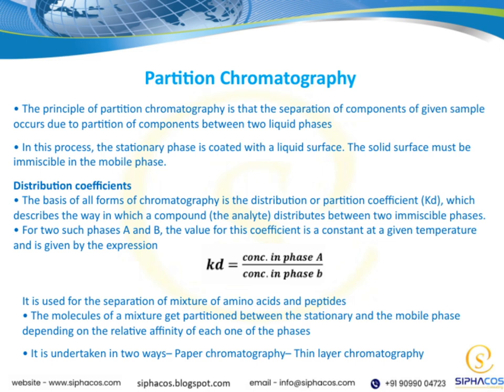A crucial concept here is the distribution coefficient, often called K_D. This coefficient describes how a compound, or analyte, distributes itself between these two immiscible phases. It's a constant value at a given temperature, and it's fundamental because it tells us how a particular molecule will behave during the separation process.